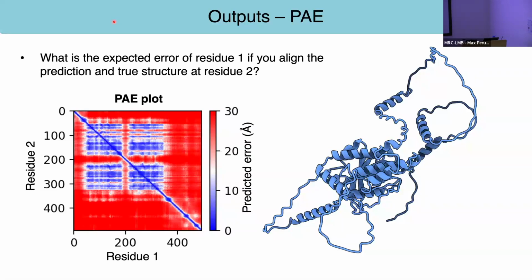So the higher this number, the less confident we are. I also see people make this error a lot. So the higher the number, the worse the confidence, right? So you either say we have very low PAE, very confident. So just be careful with your wording with this. And so let's take a look at this.